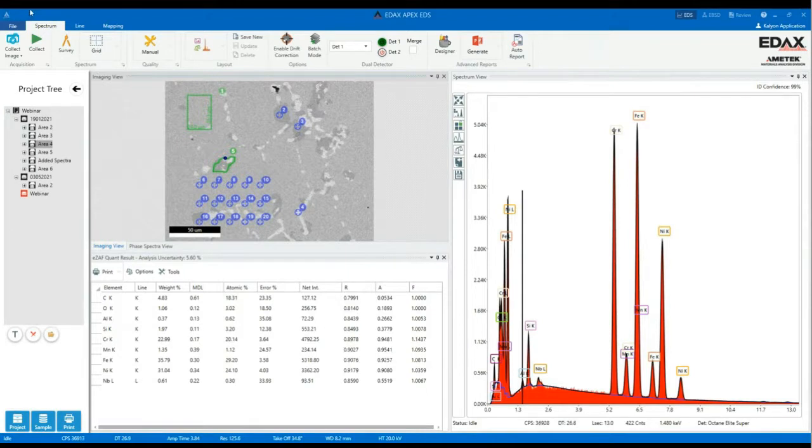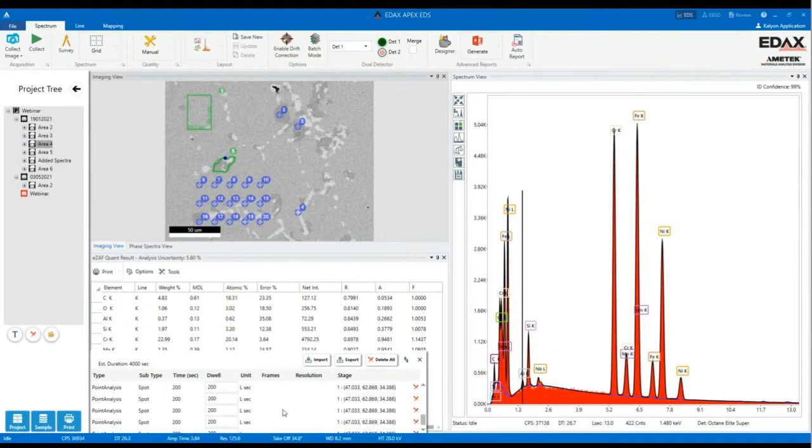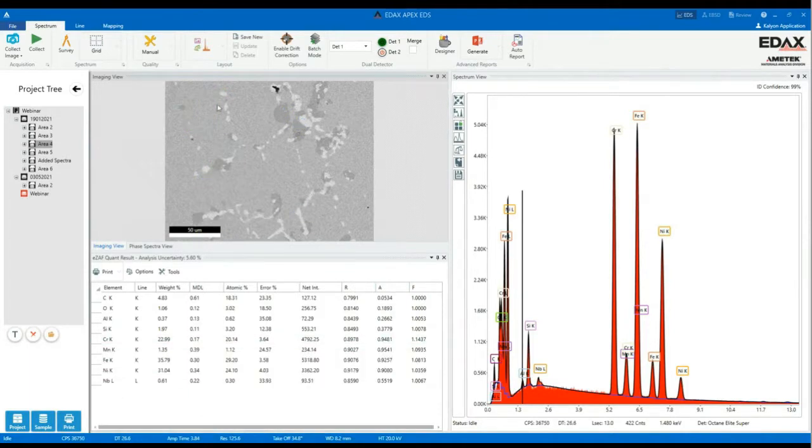What we also can do, over this A, is open the scan list. The scan list is the list where all the points, areas, and free draw we have set on the image are stored. This means we can delete some of the points or the spots when we are not happy with them. We can delete all of the set points, or we can go to the image, and if we go up to this spot highlights and click on it, we'll get rid of it. So I will click on delete all. We'll set some spots and an area.